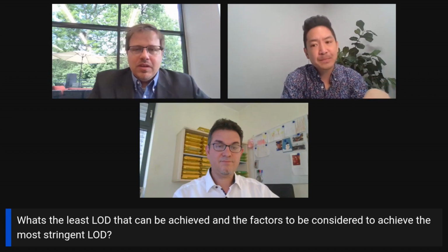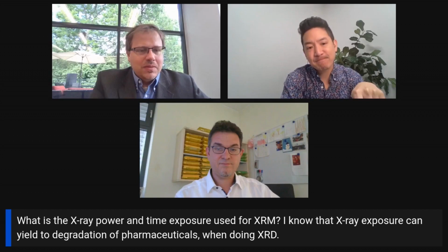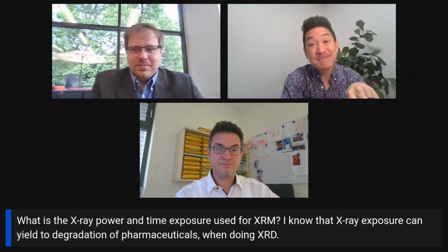All right. Now I've got a question actually for both of you. And that one is, what is the X-ray power and time of exposure used for XRM? I know that X-ray exposure can lead to degradation of pharmaceuticals when doing XRD. And I think this kind of depends a lot on the power and exposure times, right? So maybe let's start with the XRM side of things.